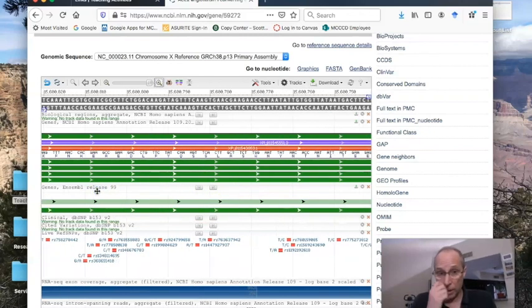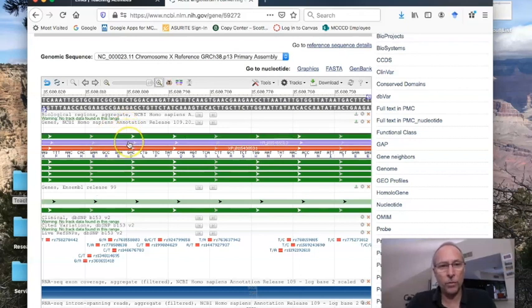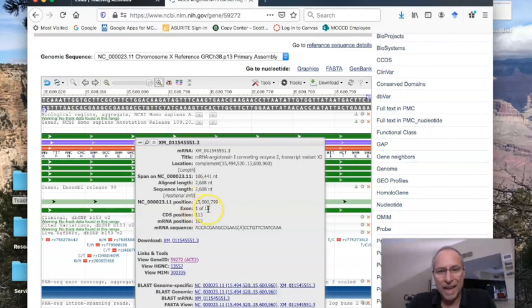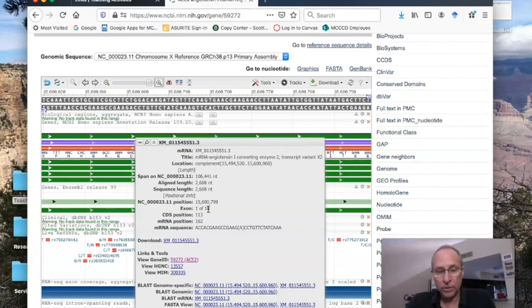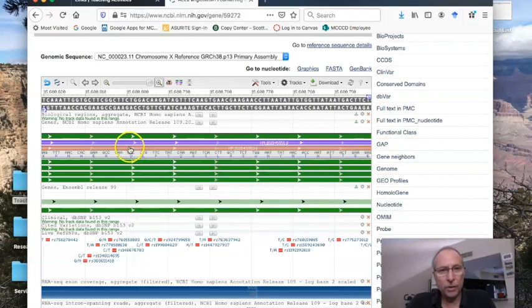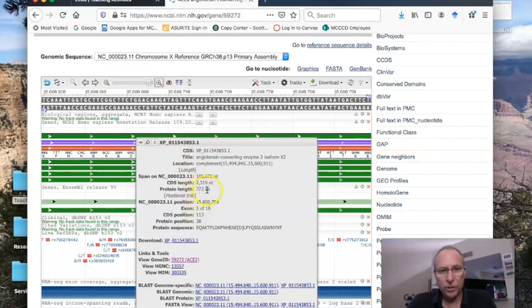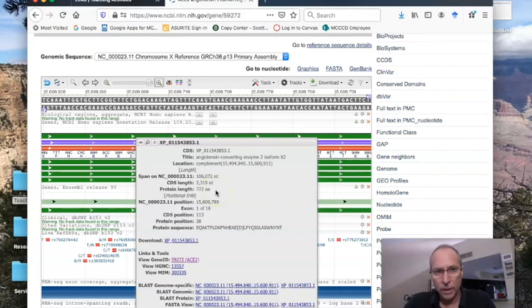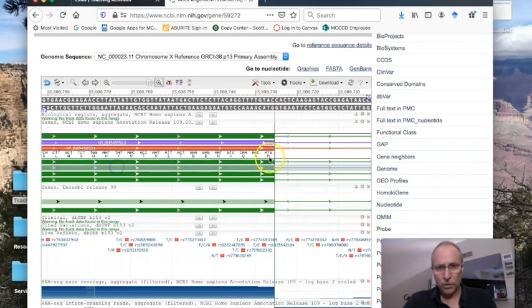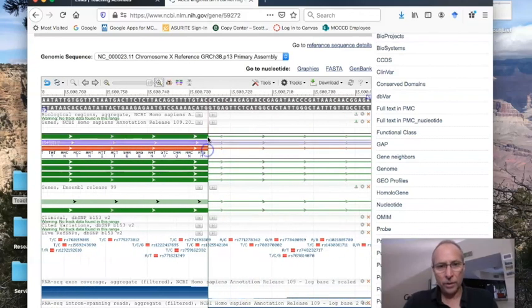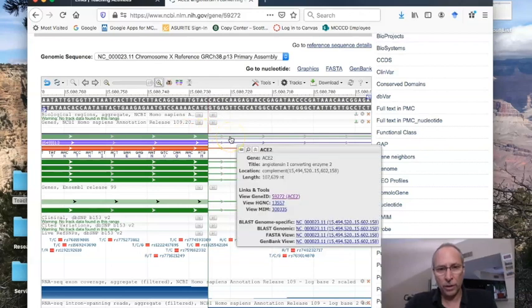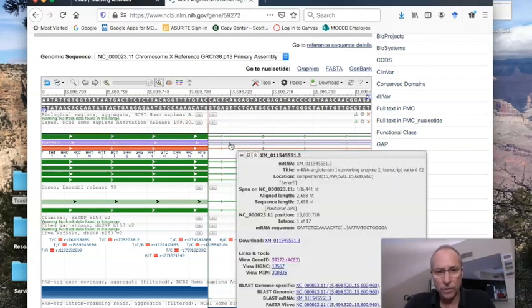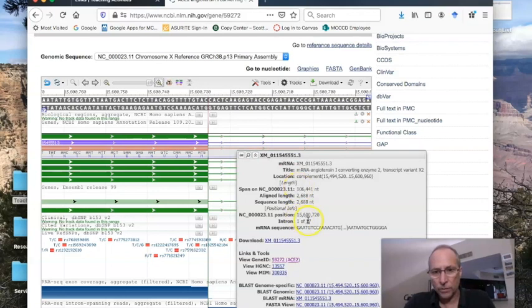It continues on and continues on. The question is, how many introns, how many exons, and how big is the protein? If we cursor over the messenger RNA this time, you'll see that this is exon 1 of 18. There's 18 different exons here, which means there's 17 introns. The number of introns is one minus the number of exons. And the number of amino acids, if we cursor over the protein, it tells us is 772, which makes it a relatively long protein. Most proteins are less than 300. Here then is the intron exon border for ACE2. There's first exon, first intron. I'm going to cursor over this intron, the messenger RNA sequence. You can see here again, this is one of 17 introns.